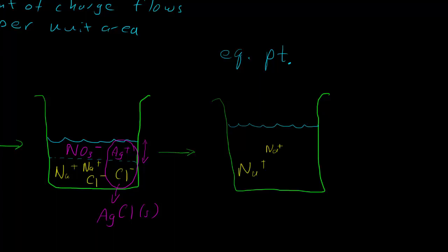And now all of our chlorides have been reacted with silver, and so we've got AgCl solid particles. And again, if we let them sit long enough, those silver chlorides will precipitate out and form a powder at the bottom of our beaker. And so then we've got nitrates in our solution instead. And again, we will have added yet more volume, and so we will have diluted things down, and so there aren't as many ions in our solution to flow around.